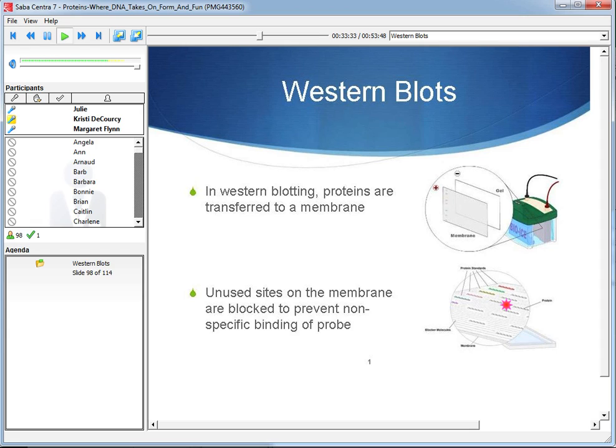And here we've used a nice colored standard, a pre-stained standard, which is good because you can confirm that your proteins did transfer. All of the spots in between these proteins, though, need to be blocked so that you don't get nonspecific binding when you probe this membrane. Generally, what I use for blocking is something I make with Carnation non-fat dried milk. Just a solution of that, and all of these spots get blocked with milk proteins.